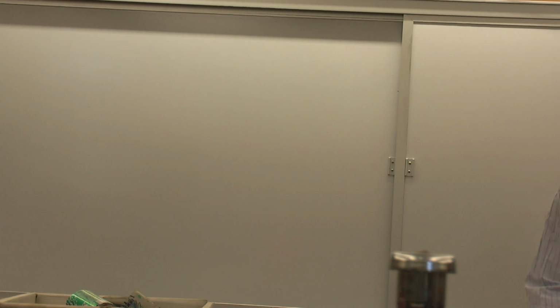So today we are doing a lab on primary cell isolation. Sound good? I'm going to talk to you about some of this stuff, about isolating cells, about why that's important, how that fits into things that we've already discussed.